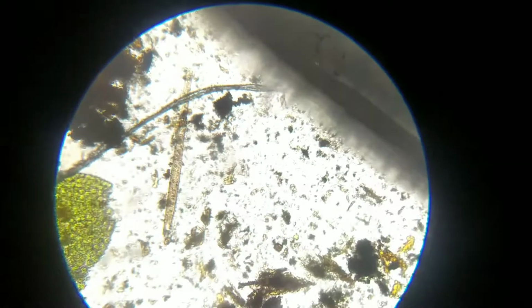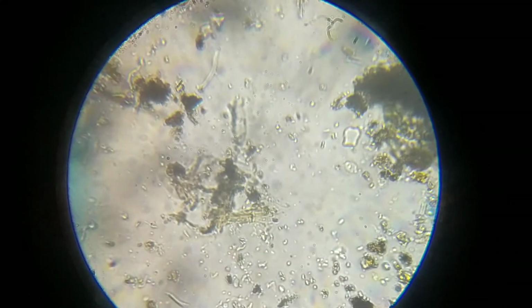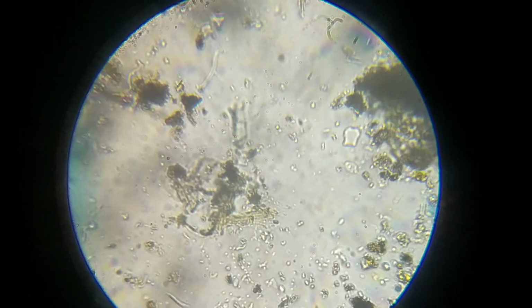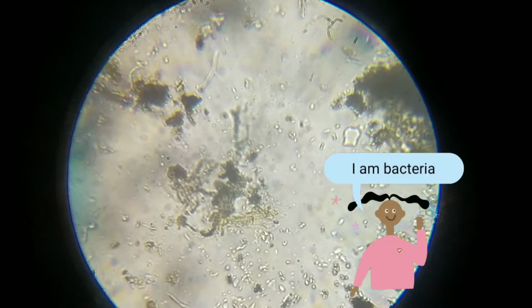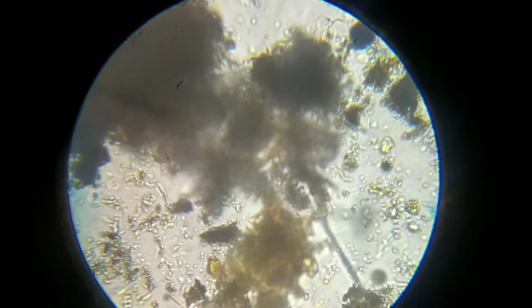So as you all can see, we have found algae. And as you can see, those white dots, vibrating white dots, those are bacteria.